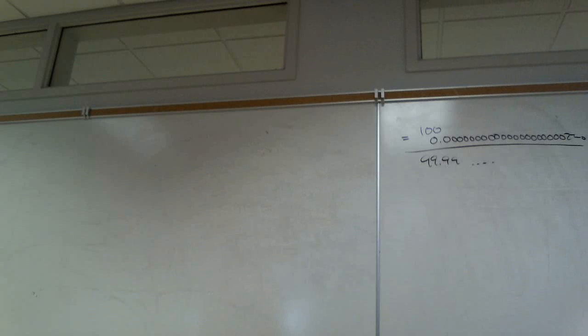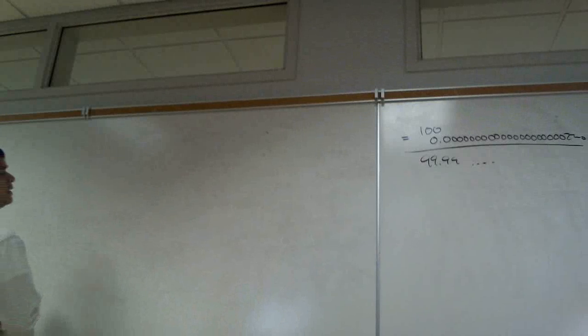Everybody in my morning class has used a pH meter before. Has everybody used one here? Pretty much? Yeah. And then we're going to measure the pH of some solutions back there. You could just pick a few, 2 or 3 solutions, just to get some practice measuring pH. You might have done this in Chem 1A as well. And then in the second part, we have the buffer that we're going to deal with. And I'm going to change that a little bit. And so let's see what solutions we're measuring the pH of.